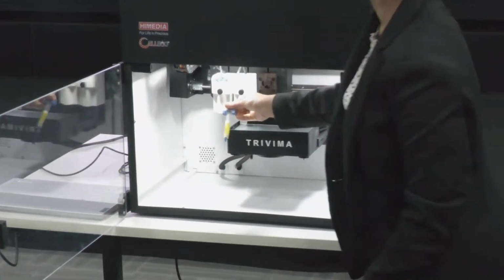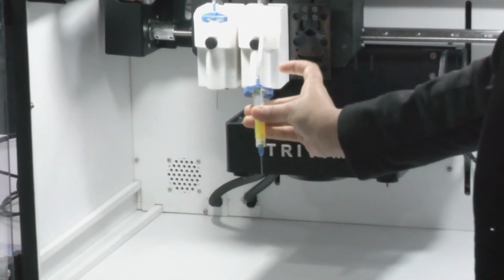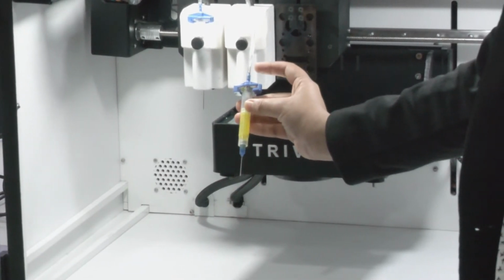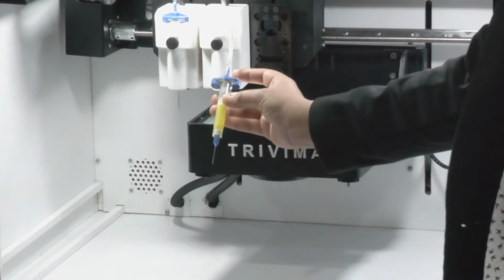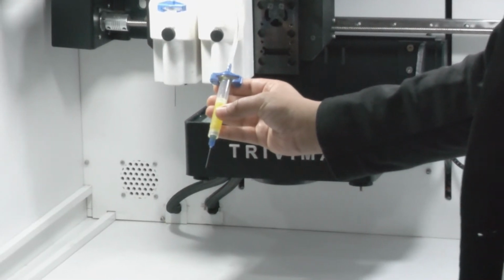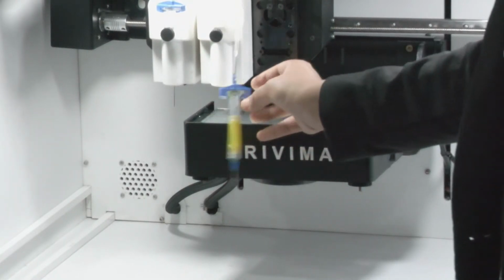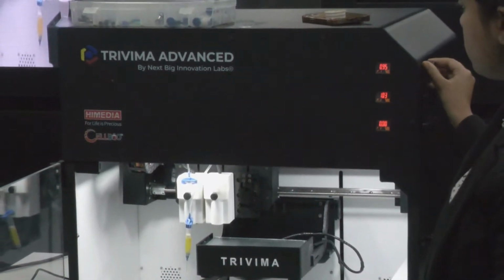So that's where the compressed air is going to keep going inside the syringe. Now your material that you're going to use is already loaded in the syringe. The compressed air will basically be the driving force for pushing the material out of the syringe. The needle that you see right now is 25 gauge. We can use any gauge depending on the cell size you're choosing to work with. You can control the pressure also. You can see monitors and regulators on top. Yeah, so that's how the extrusion method works.